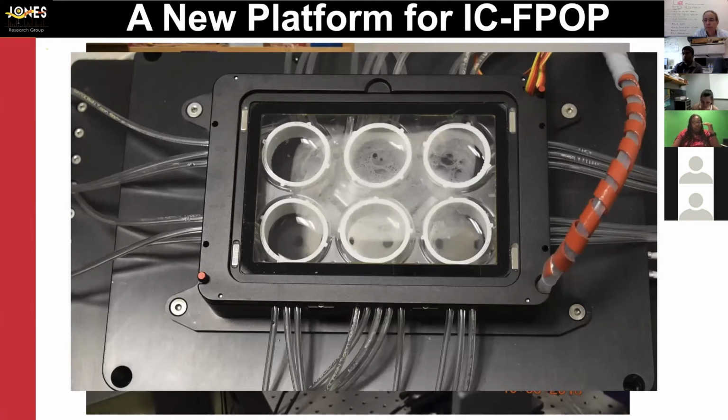And so in the next step, now that we're open from COVID-19, that's what we're working on. How low can we go? Obviously, mass spec itself is moving towards single cell proteomics. Can we do that with FPOP? That's something we're moving towards, just because of the variability between cells. You want to see how low you can go. But right now it's 1 million a sample.